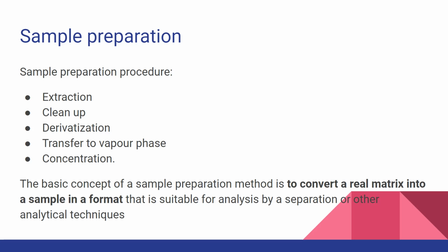Sample preparation. Most of the samples are not ready to be directly injected into the instrument. They need to be prepared. Sample preparation is often several processes that add to the complexity of the analysis. Sample preparation procedures can be mentioned as extraction, cleanup, derivatization, transfer to vapor phase, and concentration.